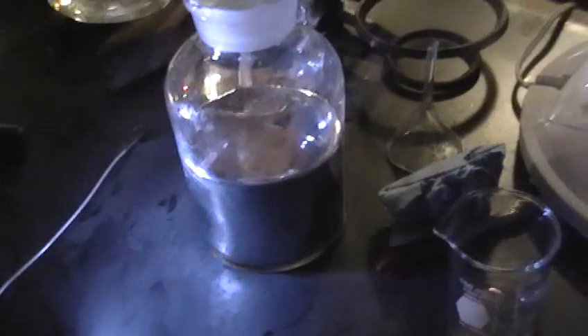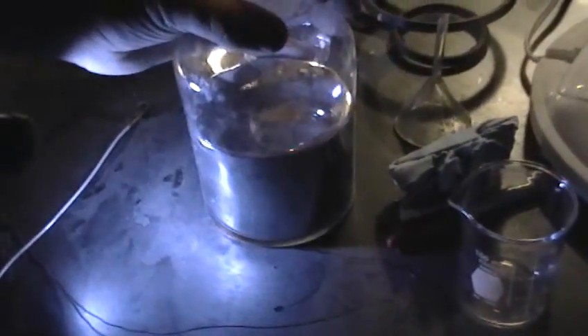This is the flask of mercury that we still have to go through. That's about 15 pounds of mercury in that flask — it's about 500 milliliters.